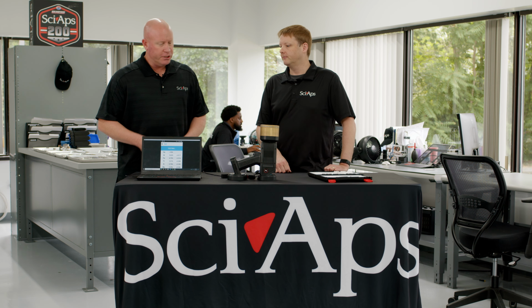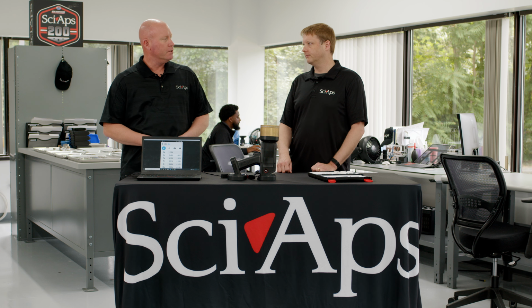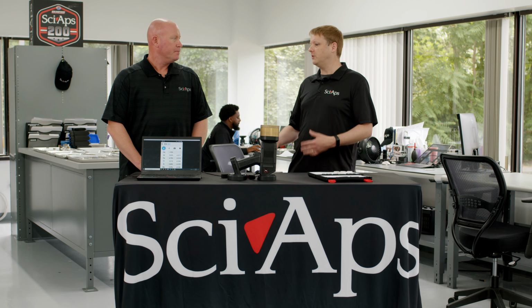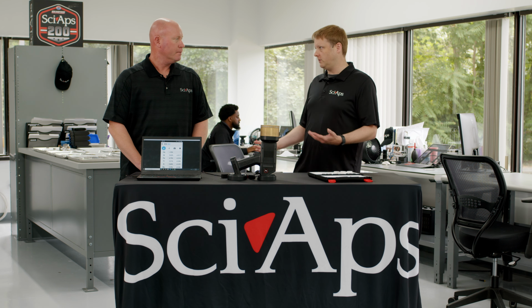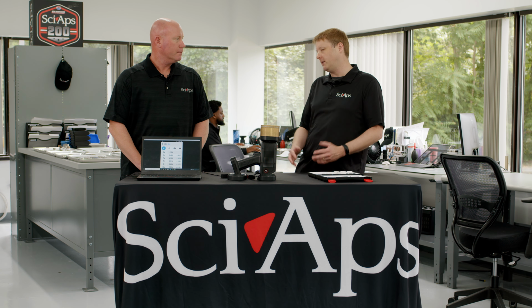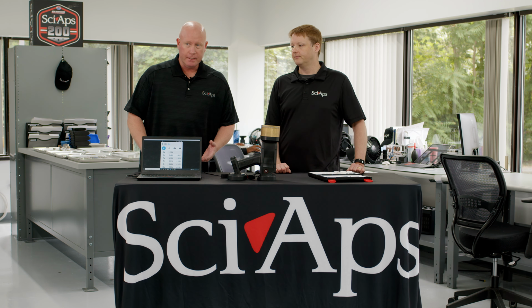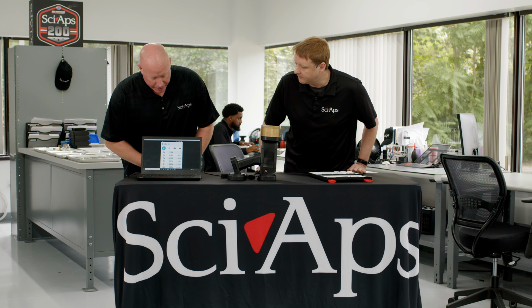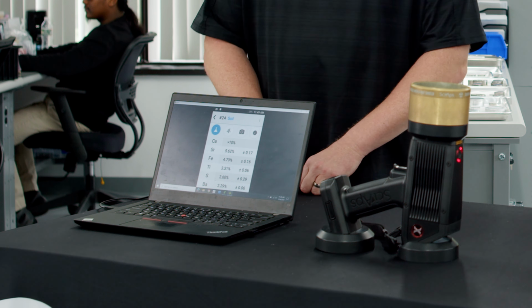So if I'm just trying to do a quick screen on it, can I change the amount of time that this test is going to take versus maybe a longer test that's going to give me better accuracy? Yes, you can. If you're doing a quick screening, it might be 5 or 10 seconds for a test. A longer test might be a minute or more if you want to get to really, really low detection limits, really good sensitivity. So it just depends on what your analytical goals are. Oh, excellent. While it's sitting here in the test stand, we really don't have too much to do except wait for it to finish, and it looks like it's done. So that took about 30 seconds?